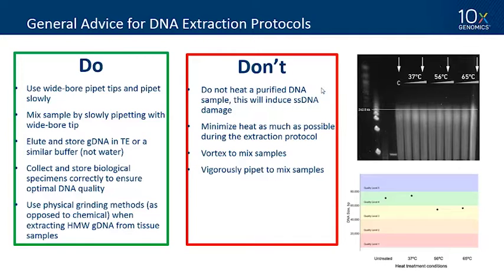Don't vortex to mix samples or vigorously pipette-mix — and importantly, don't heat your samples. We've studied at which stages of a protocol you can include heat and at which you cannot. Heat can cause single-stranded DNA damage, especially during bead elution or pellet resuspension. We show samples that look identical on a pulse field gel but were heated at various temperatures for varying times; when carried through the Chromium Genome assay, you can see quality level dropping from 4 down to 3 under higher heating conditions. Avoid heating a purified DNA sample.